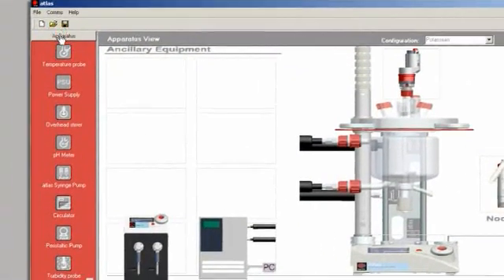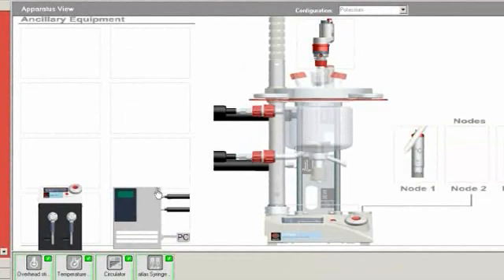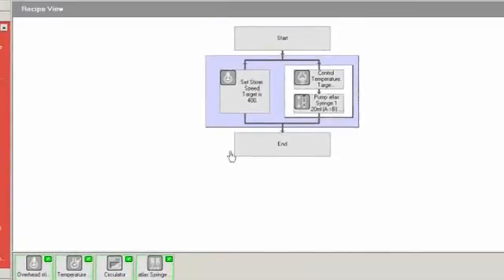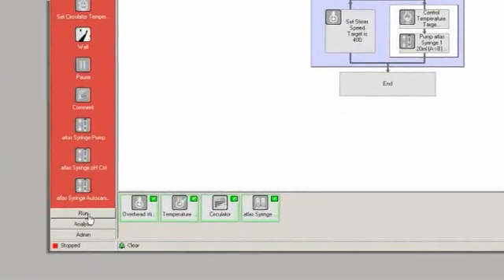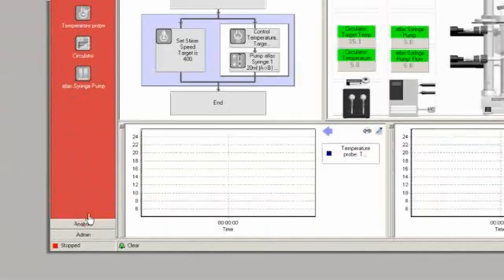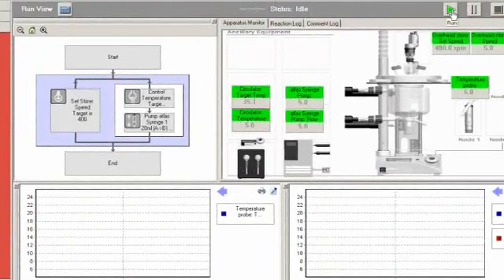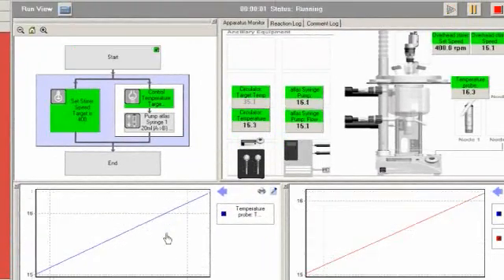The software has three major views: apparatus to define the sensors and controllers, recipe to define the reaction conditions, and run for automatically conducting the experiment whilst recording and displaying the data.